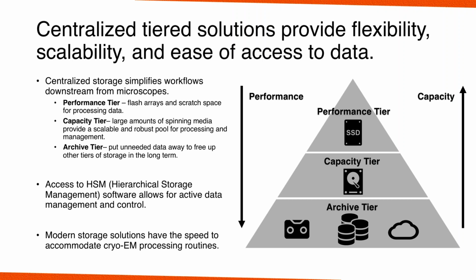And that's a perfect equilibrium between performance and capacity. These modern solutions have more than enough speed to accommodate cryo-EM processing routines, as I'll show you later. And then the performance tier: the cost per terabyte is quite high, because solid state is still, I mean, solid state costs are coming down. But you can consider it as SSD scratch and processing nodes, or maybe you can afford an actual flash array, that kind of thing. It's going to be very high speed, but not necessary for operation.